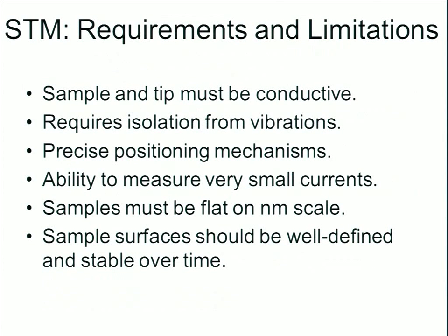Now some requirements and limitations for a scanning tunneling microscope. One thing worth mentioning is every tool has its pros and cons. It has places where it shines and is the best tool around, and other places where you would want to select another tool. It's the same as you would select a hammer to drive in a nail, and you would select a screwdriver to turn in a screw. But if you switch the two, you're not going to have the desired result.